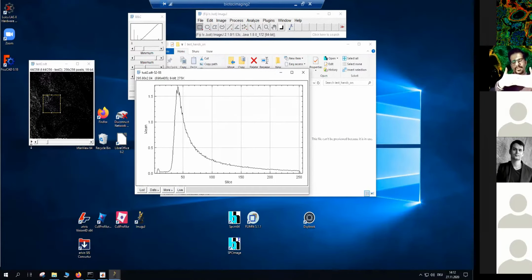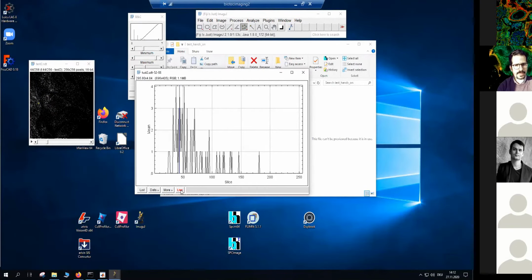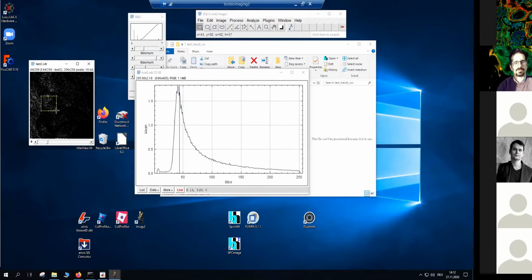When I just plot it across the time, what I get is the decay curve. That's the same story for a single pixel as well. But since the intensity is low, if I do that, it's super noisy. So that's why it would be more visible when I do that in the region of interest. So what we have here then is like TCSPC data. These are images with lifetime information. This is what we would like to analyze.